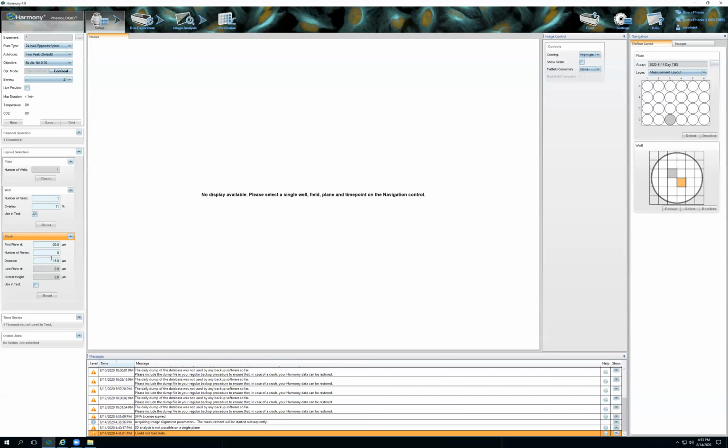I just want to find my spheroid, the general spheroid. So I kind of do where I think my spheroid will be, and I start there. So now I can say, okay, I think it might be between this plane and this plane, somewhere along there. So I'm going to come up here and do test.